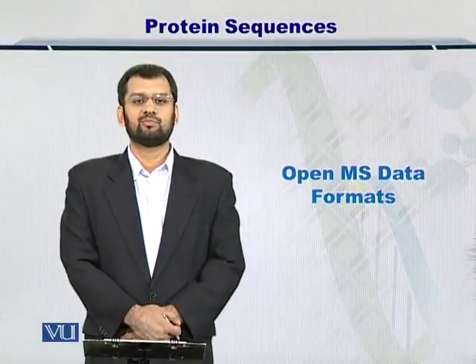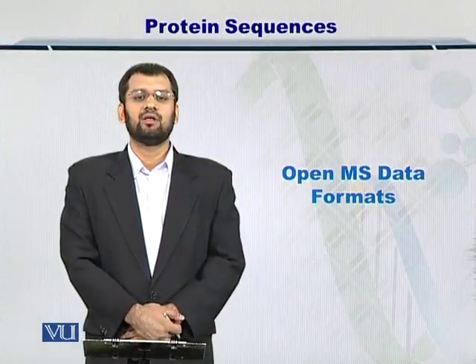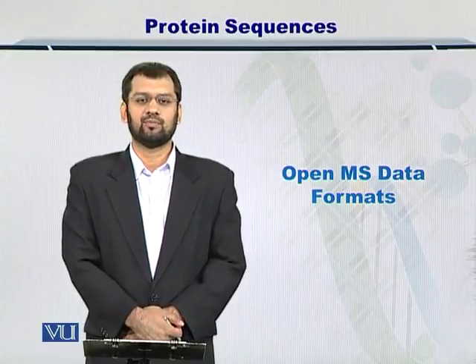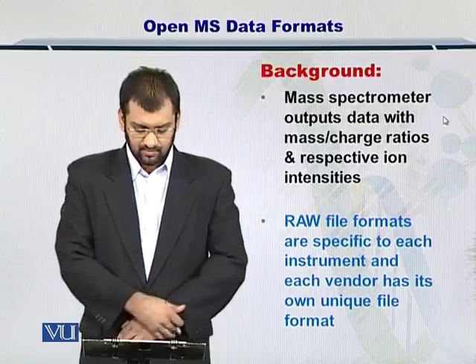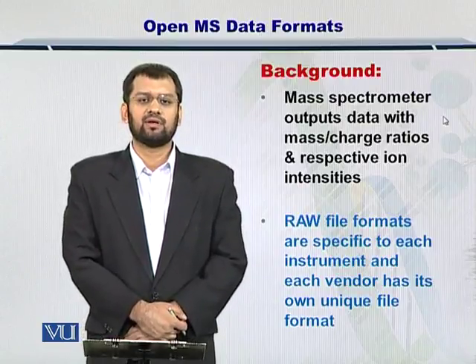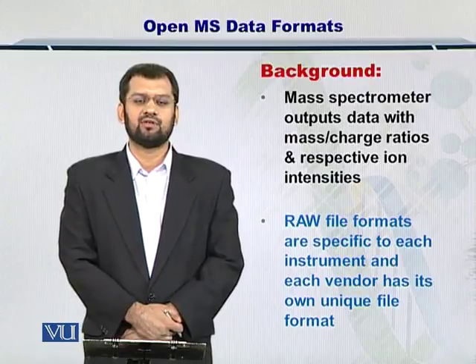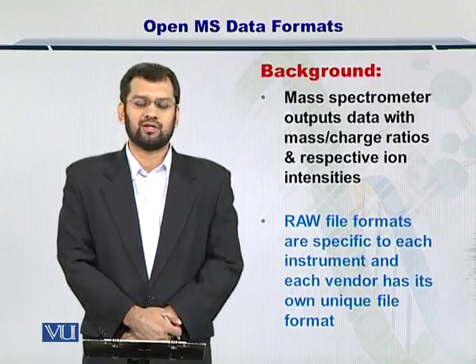Dear students, in this module, we're going to talk about the open file formats that exist in mass spectrometry-based proteomics. The mass spectrometer measures the mass-over-charge ratio and abundance of proteins and peptides in its chamber and outputs it in the form of raw data.